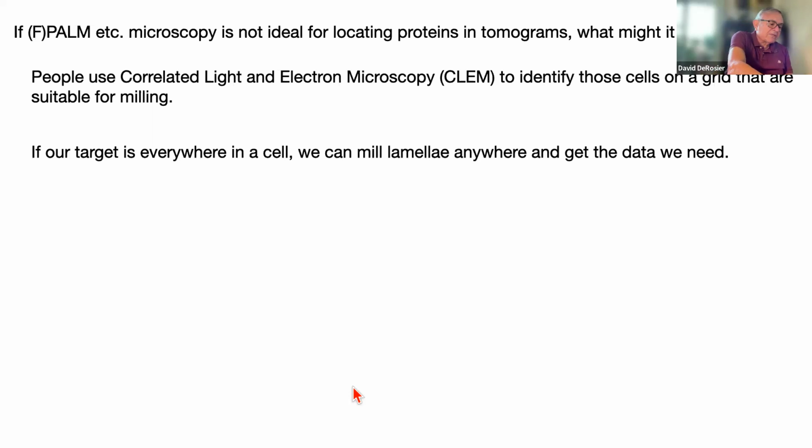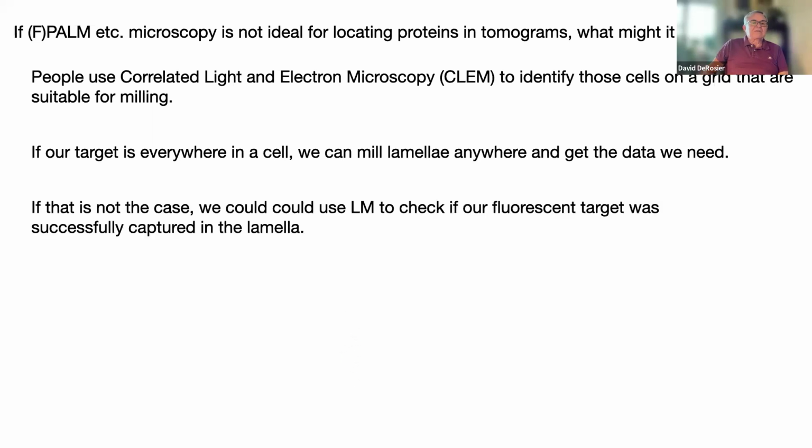If our target is everywhere in the cell, of course, you can mill a lamella anywhere and get the data you need. If it's not, you could potentially use fluorescent light microscopy to see if the fluorescent target was successfully captured in the lamella. And I saw an example of that recently from the laboratory of Elizabeth Villa.